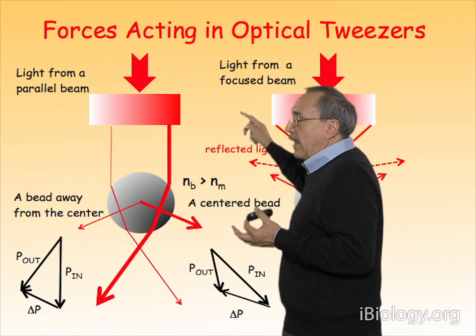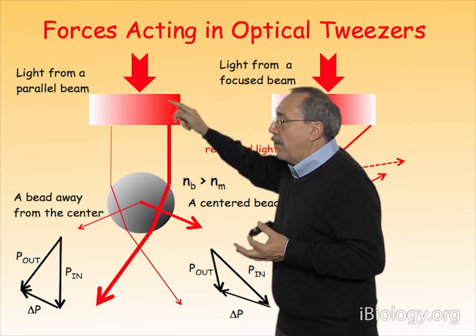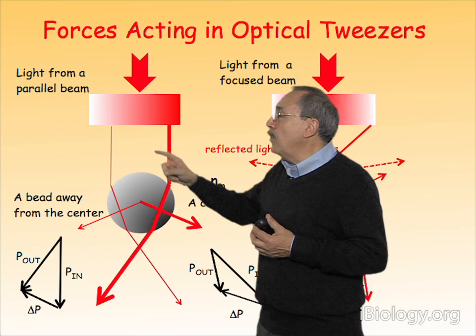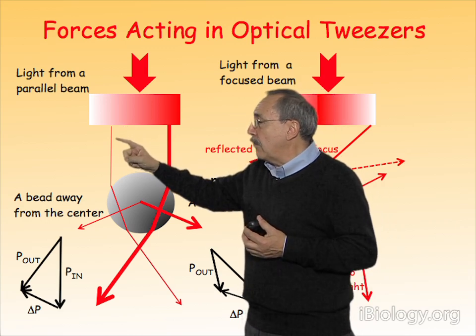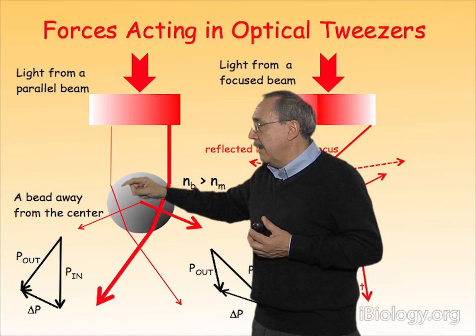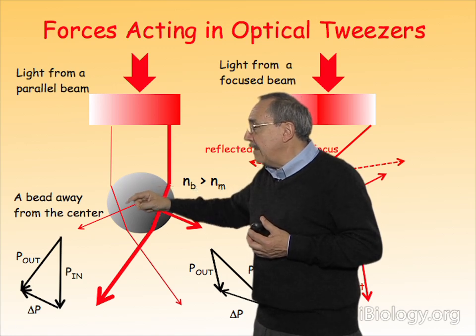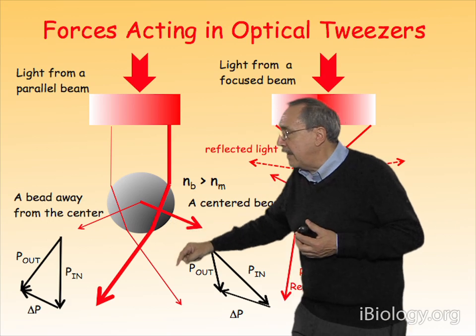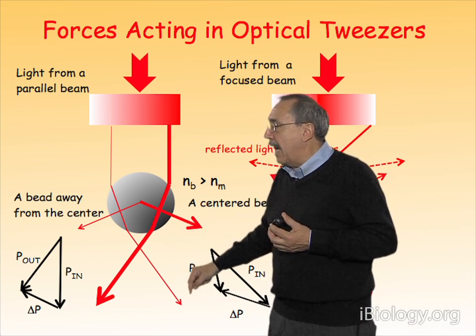So it will eventually decay. So there is a Gaussian profile of intensity in the beam. Okay, now let's assume that a peripheral ray actually first hits the object, in this case this plastic bead. So what is going to happen again is that the bead is going to refract the light along this line and then refract it again, as you see here coming out.